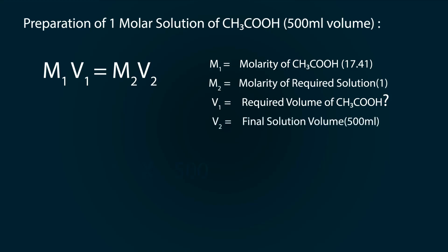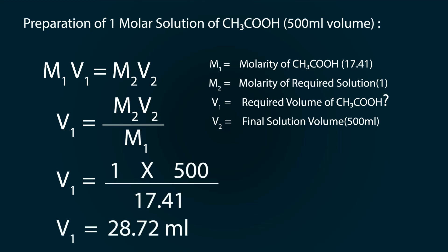which is 500 milliliters. Now rearrange the formula and put values into it, we get our volume as 28.72 ml. Let's start preparation. First of all take volumetric flask of 500 milliliter and put funnel on the top.